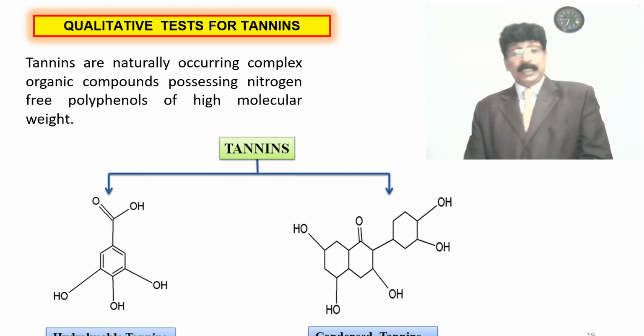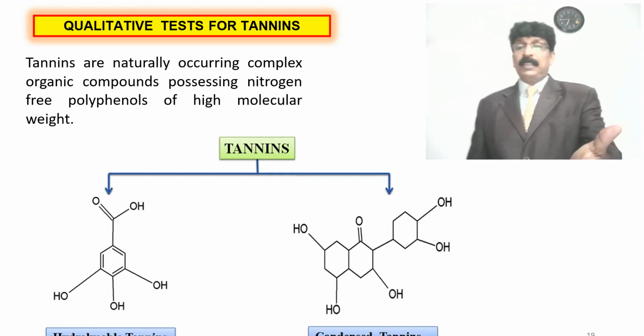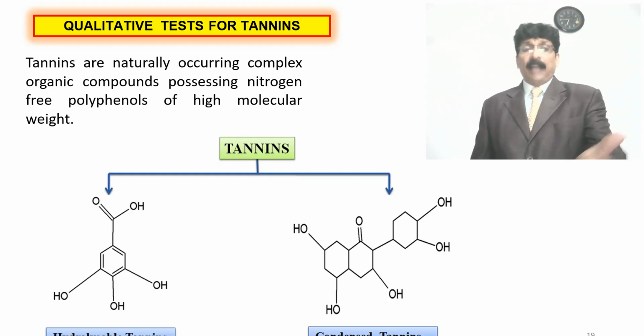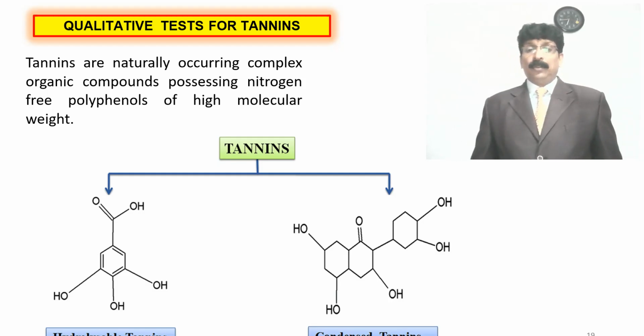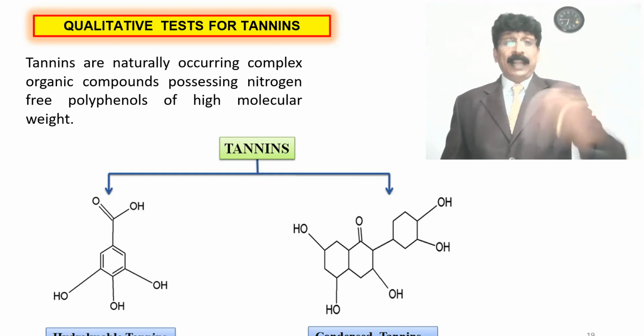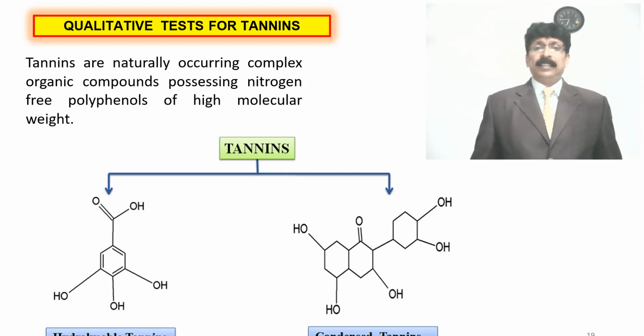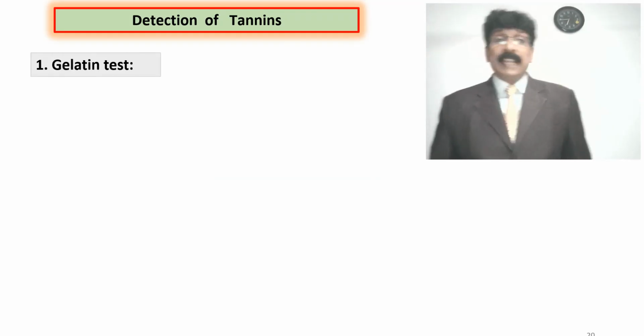Hydrolyzable tannin, just now we have seen this structure, and condensable tannin having a multi-structure. That is condensed tannin, and this is hydrolyzable tannin. These two tannins are present as in classes. Detection of tannins: the first one is the gelatin test.